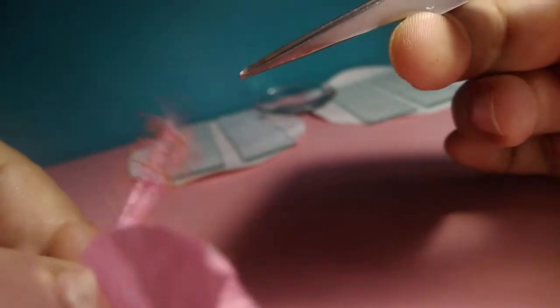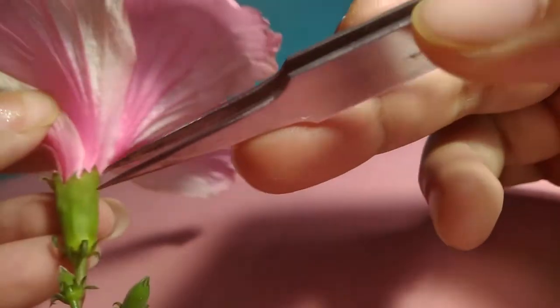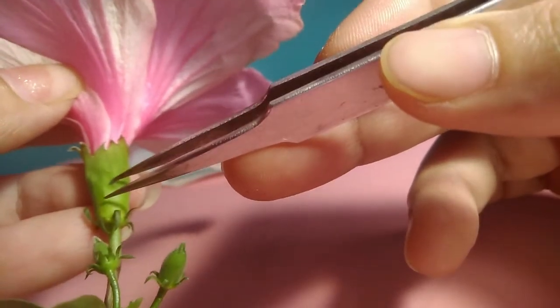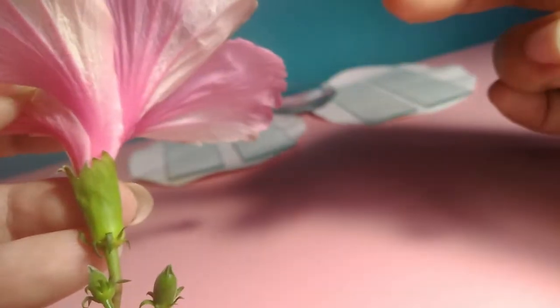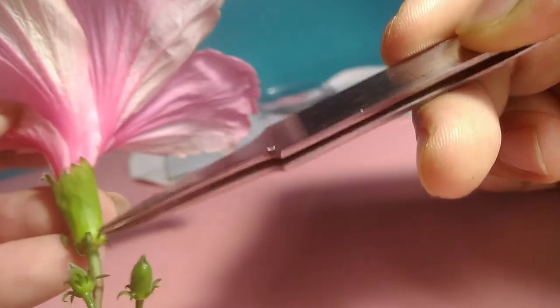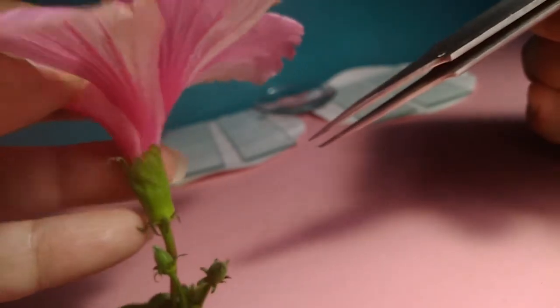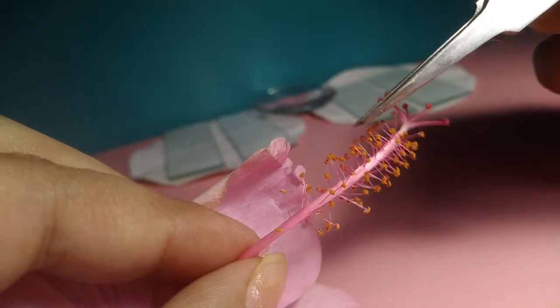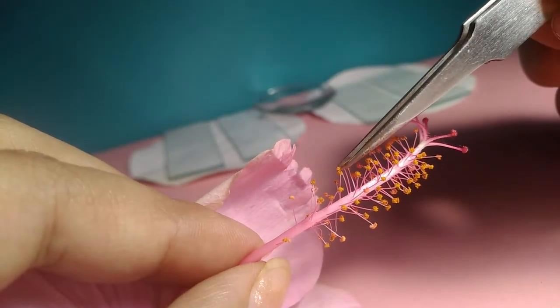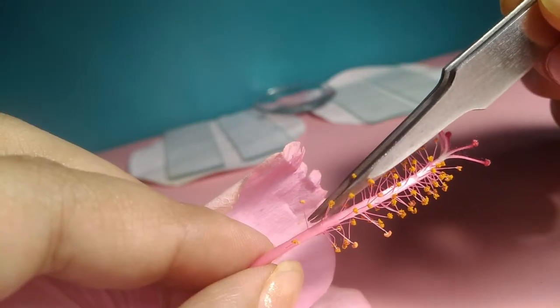Actually the style runs all the way down here and it reaches below here, because here we have another part which is known as the ovary. So the style runs all the way down and reaches the ovary. The style connects the stigmas to the ovary down below. We will see the structure of ovary in a little while dissecting the flower. Now what are these called? These yellow dot-like structures are called the anthers, and the stalks which are holding the anthers are called the filaments.